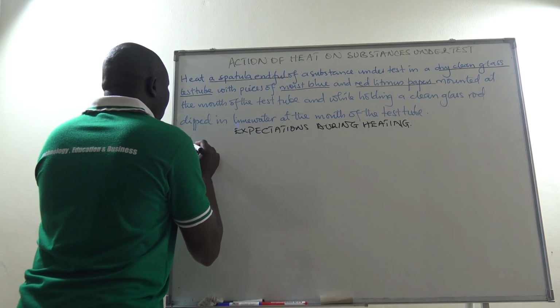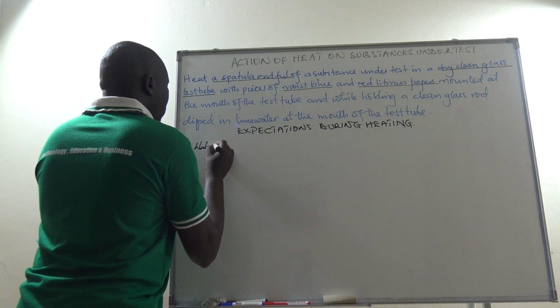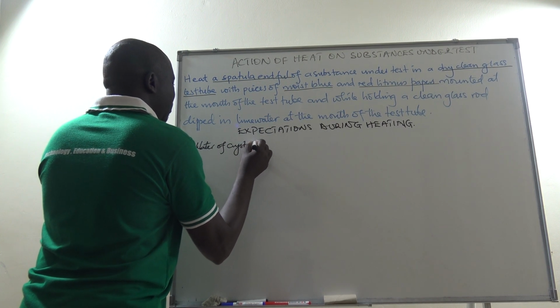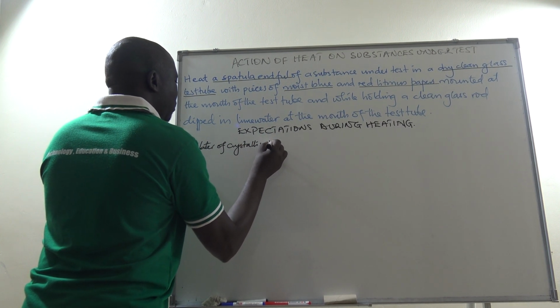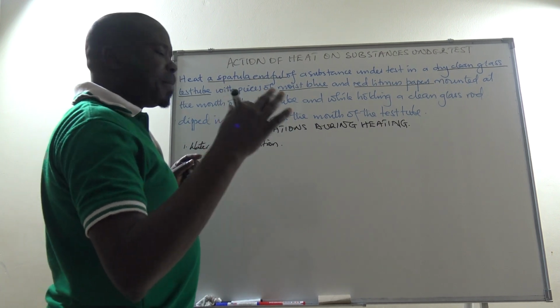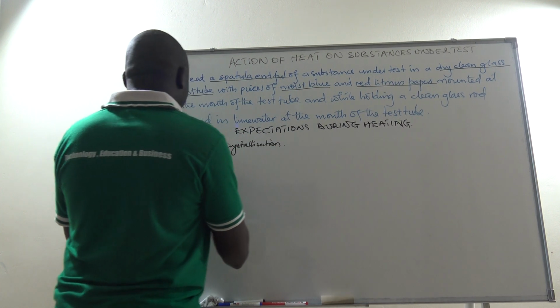One, we expect to get water of crystallization, which normally forms on the cooler part or the cooler wall of the test tube. Expect to get water of crystallization.